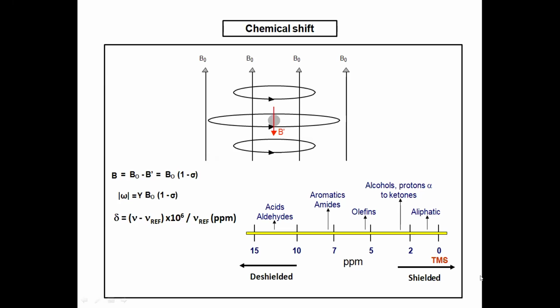And if it is in the opposite direction, then it will generate a signal at a much higher field.